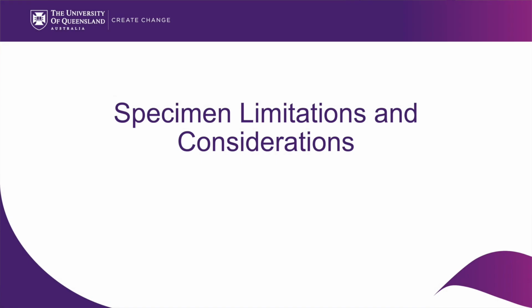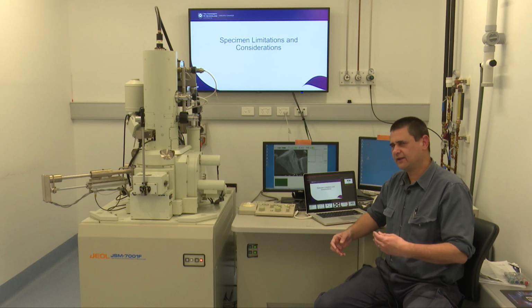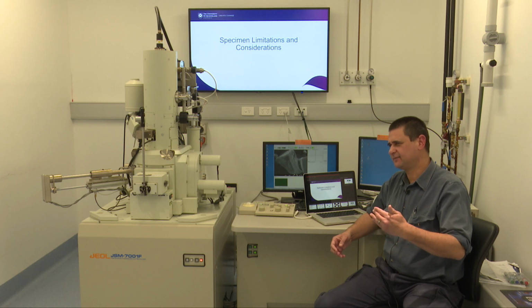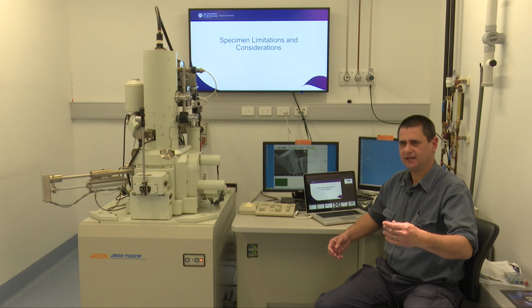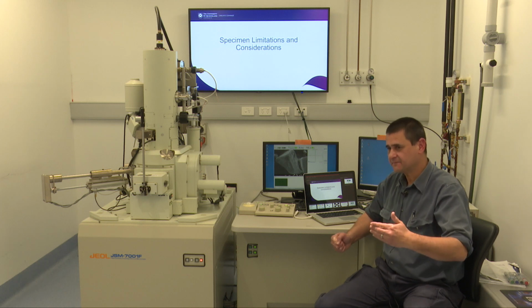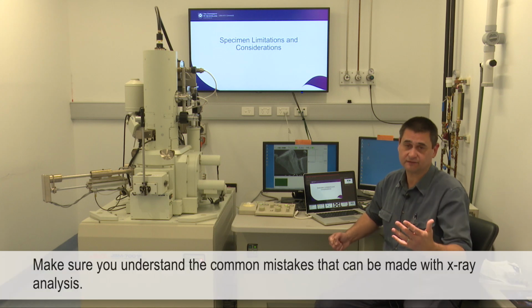This next section is called Specimen Limitations and Considerations. It's more of a grab bag of a few points that I need to make to the average user, because I see this mistake crop up again and again and again. Not by everyone, but by some people. So I think one of the ways forward in X-ray analysis is to make sure that you understand some classic mistakes that can be made, and we just avoid them.